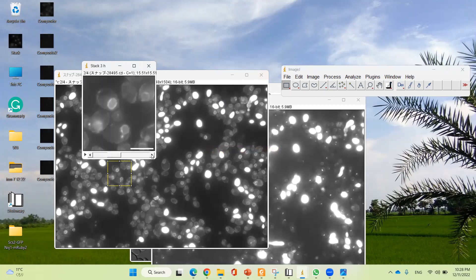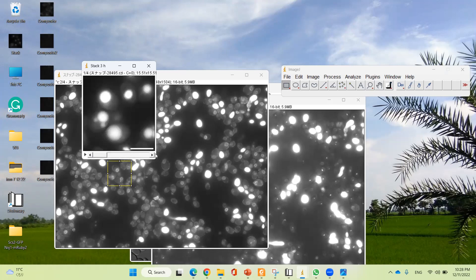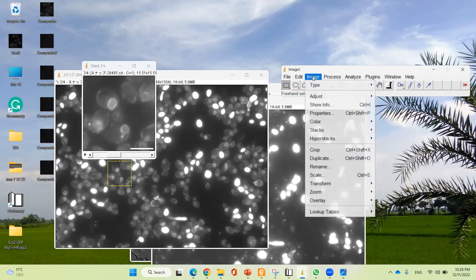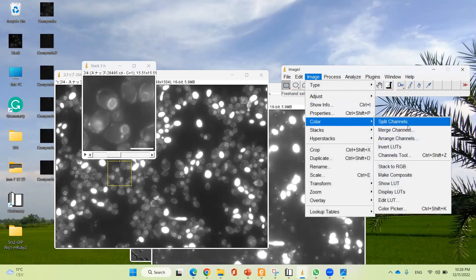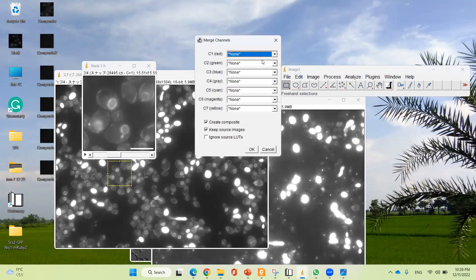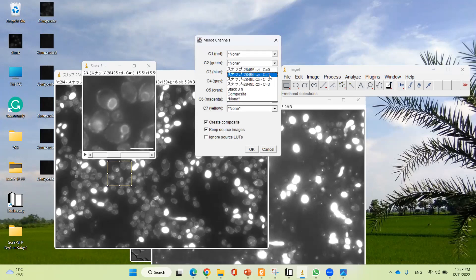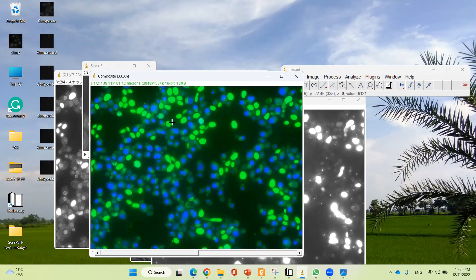Now I'm going to merge green and blue. Green is C1 and blue is C0. Go to Image, Color, Merge Channels — green is 1 and blue is 0. Click OK. This is the green and blue merged color.